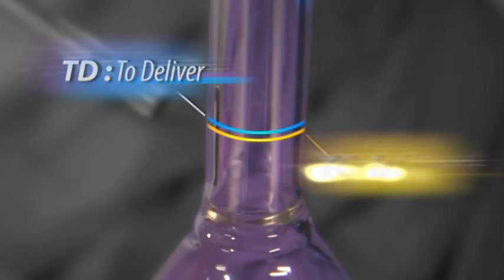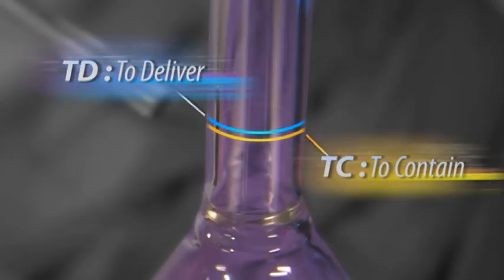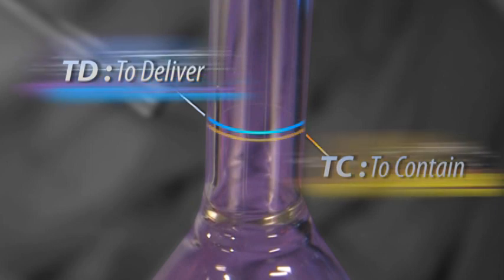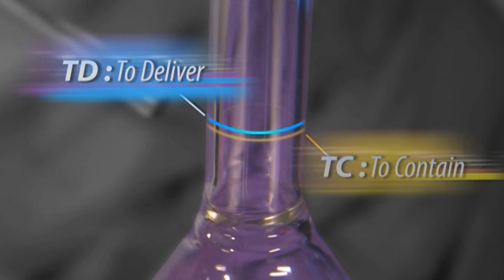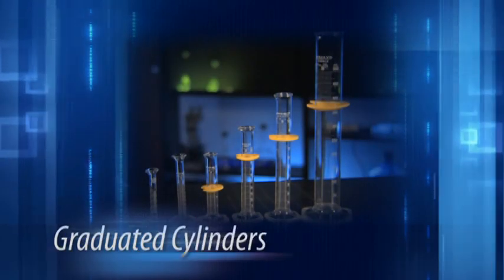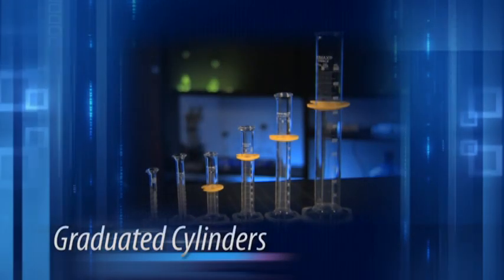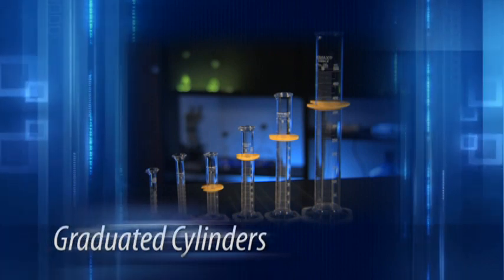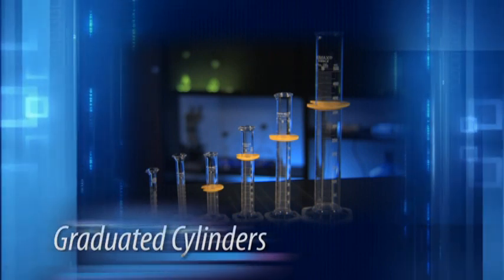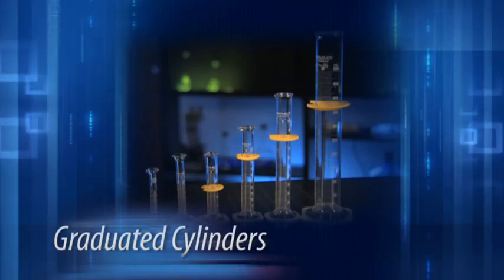The TD mark above the TC mark includes the amount of solution that remains on the wall of the flask when emptied. All TD flasks are calibrated to allow for the film of solution that remains on the walls of the vessel. Graduated cylinders are long cylindrical or conical shaped plastic or glass containers and typically range in size from 10 milliliters to 1,000 milliliters.